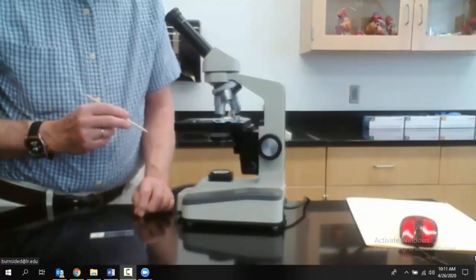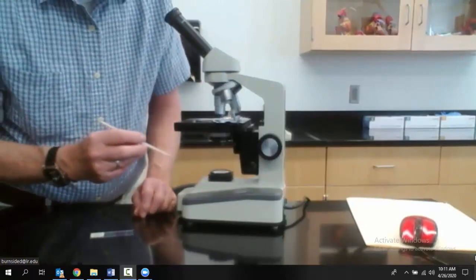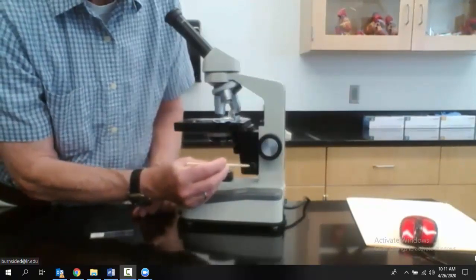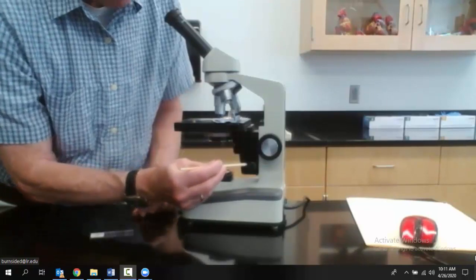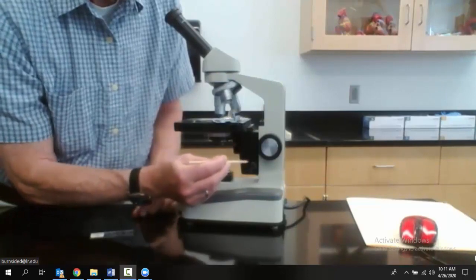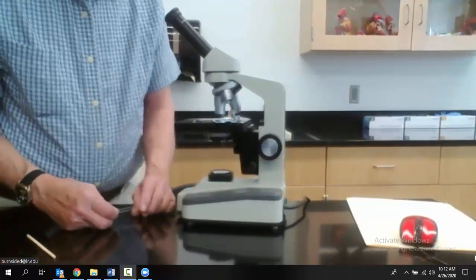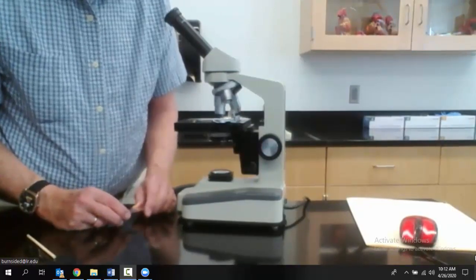Then the other thing we have to know about a microscope is how to focus it. You have a coarse adjustment, and then you have a fine adjustment down here. It's a little harder to see, but the coarse adjustment changes the focus a lot until you get close, and then the fine adjustment down here takes a more sensitive touch and brings it more nearly into focus. Very fine adjustment, as the name implies.